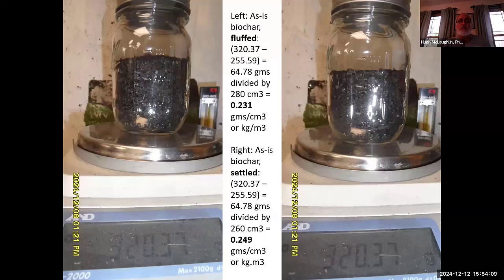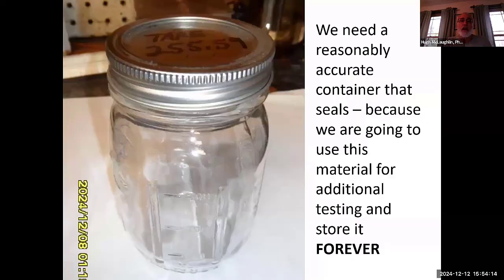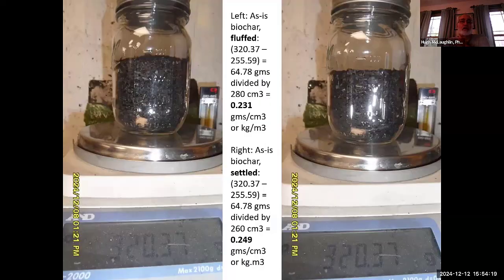This is a sample of a typical biochar. So if you noted, we have a tare. So we weigh the jar clean and dry. We write it on the label. We have a scale somewhere. And the interesting thing about biochar is its particle sizes are such that it'll settle somewhat like cereal, and it'll also fluff up. So the amount that was in the truck was a smaller volume than the amount that was dumped on the ground, because in the process of being dumped, it fluffed. It expanded because it didn't pack as nicely.